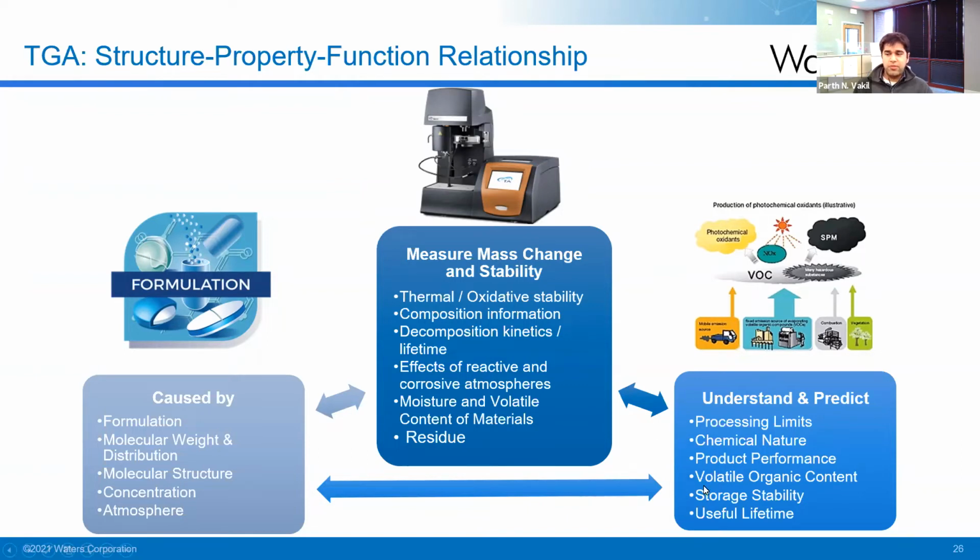One of the examples that my colleagues at TA have told me: whenever you step into a new car, you think, oh, the nice leather seats smell really good. That is actually some volatile organic content that is still coming off. And so they have to manufacture them so that there's not a very high level that can be harmful to human health. And when you do kinetics, you can understand what's the lifetime.